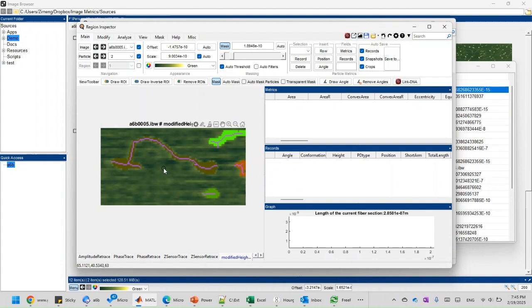All right, so that's that. We already connected our DNA molecule using this eraser tool. You press Control E again, and it toggles that mask mode, eraser mode, off. Now you can simply click the DNA molecule. Let's turn on transparency. So that's how we do it for disconnected DNA.